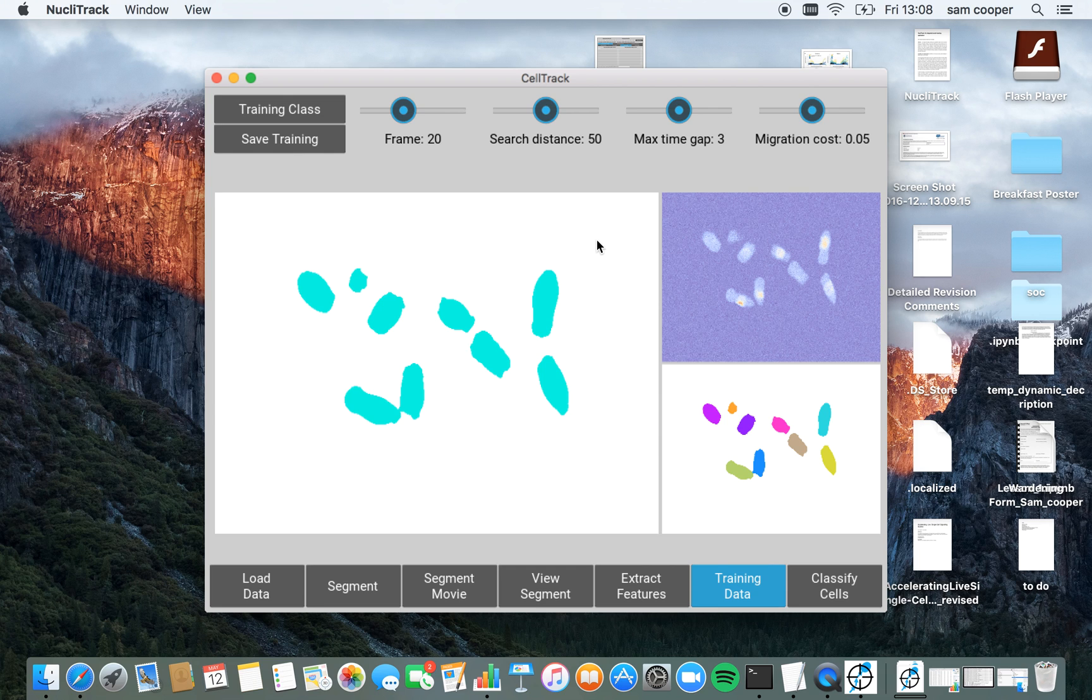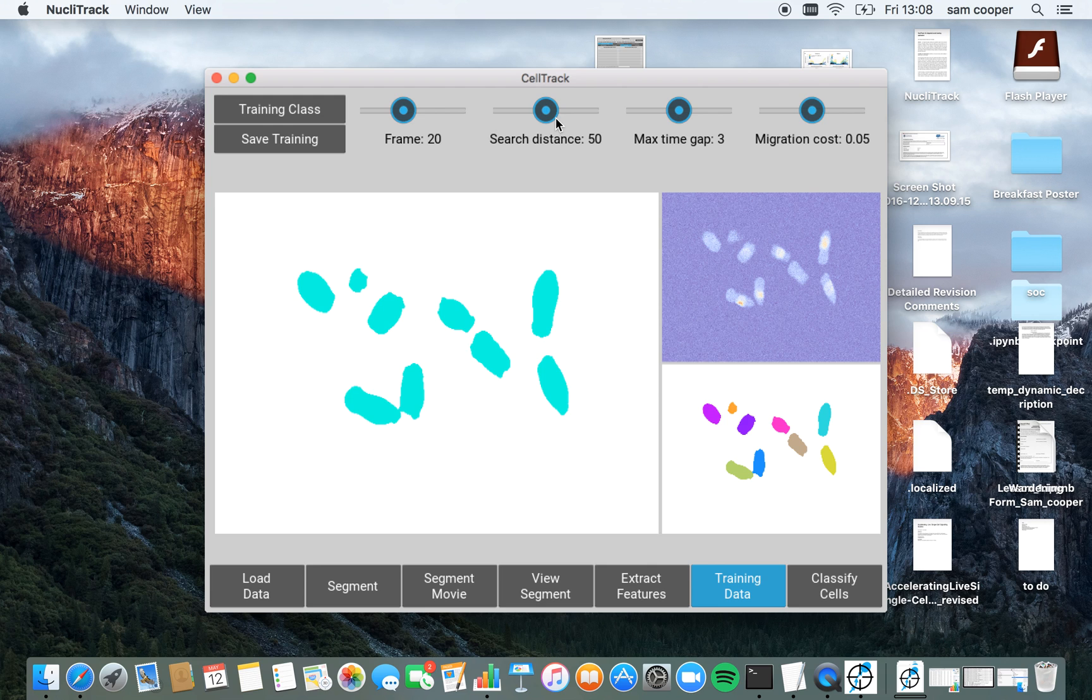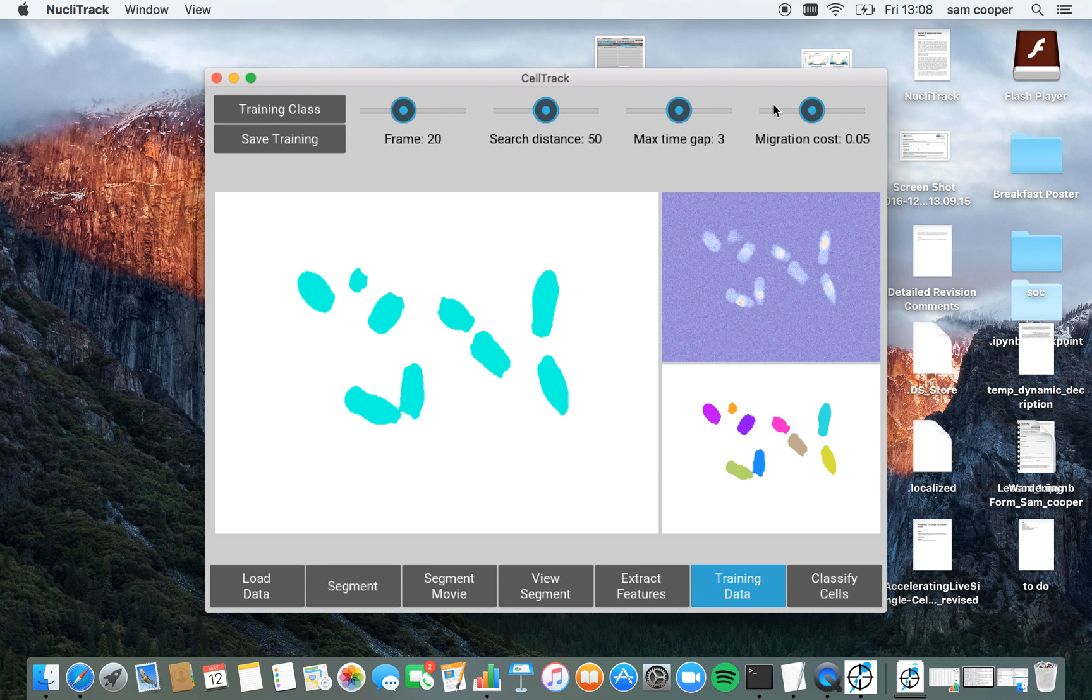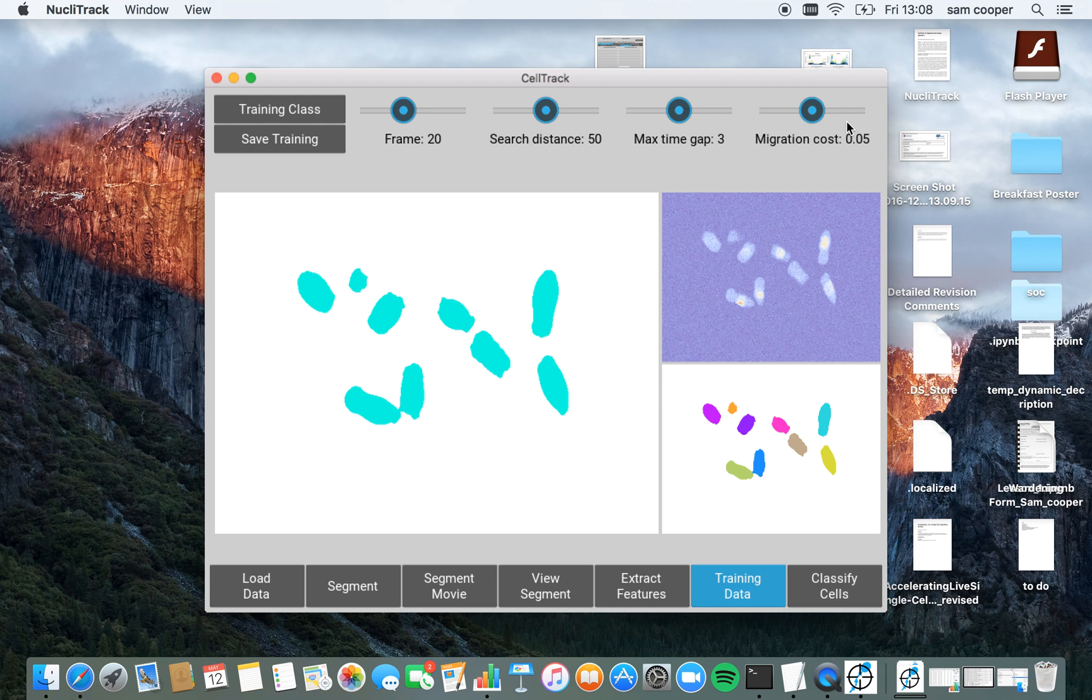I also have these parameters up here, which I can adjust and these modify the area in the past frame that the algorithm searches for. So cells which are moving loads, you might want to increase the search distance and reduce the migration cost. Whereas cells which are remaining pretty static, we can reduce the search distance, speed the algorithm up and we can also increase the migration cost.